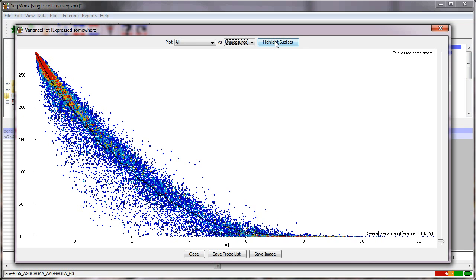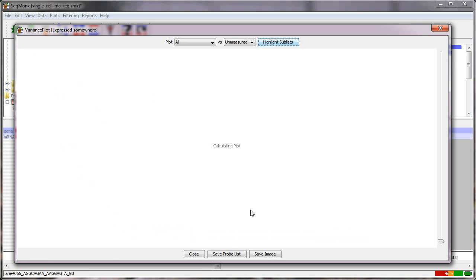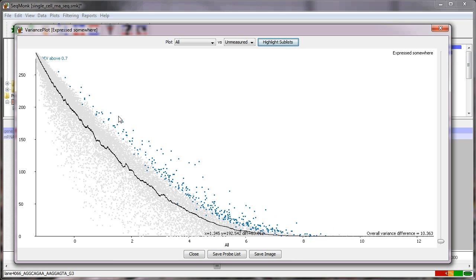We can have a look and see if the variable genes that we picked before are also relevant in this plot. So if I highlight those on, again you can see that they do fall on the top of this view as well. So we could have made the selection directly on this data, so in the same way when we did our variance plot we can filter on this data, but there should be a very high degree of correlation between this information and what we saw from just plotting the standard deviation.